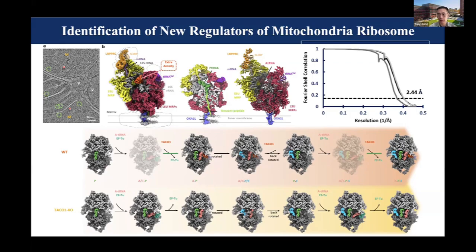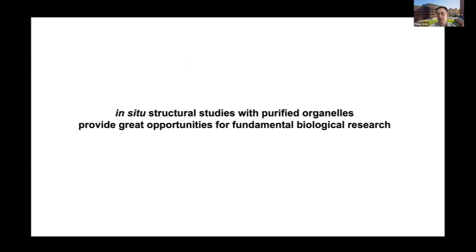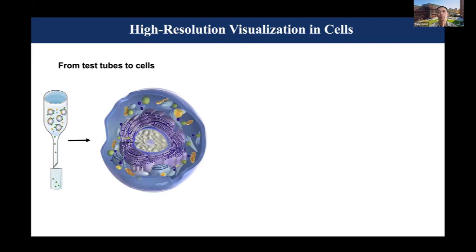Okay, I quickly glossed over this. I just want to show you the concept that in situ structural studies with purified organelles can be very effective for the particular problems you're looking at. I want to spend most of the time talking about the most enticing target we want, right? For many of us for decades, it is really: can we do the type of structural biology that we do with a purified sample in the test tube directly in cells?